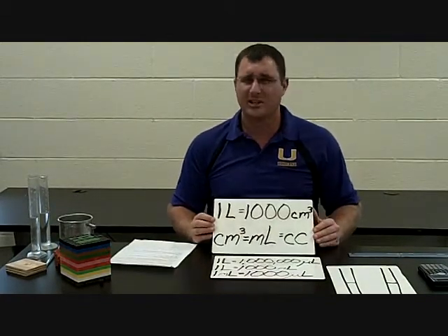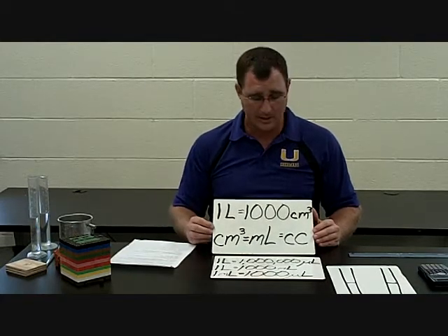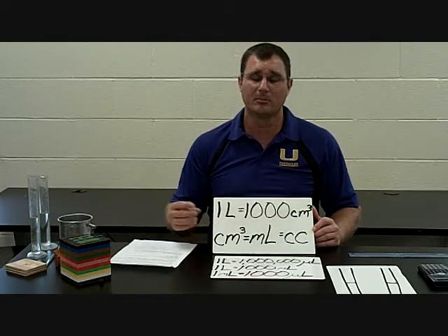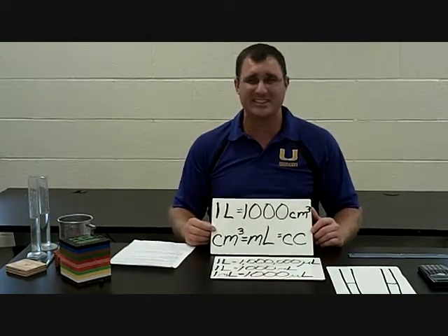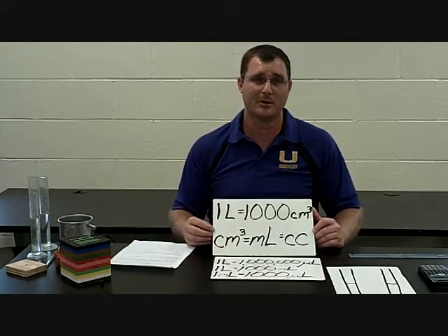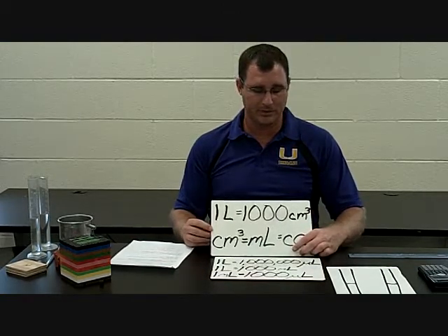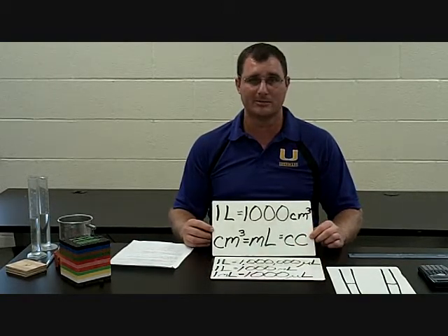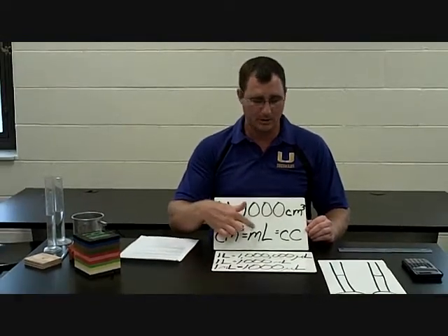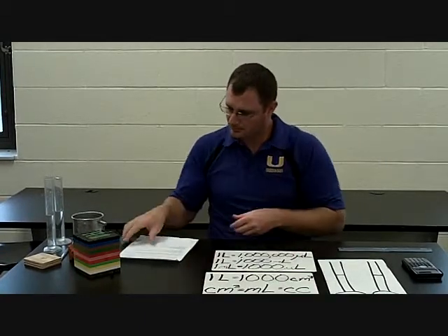And we'll use milliliters a lot in the chemistry lab. We'll refer to things as get 50 mLs, stuff like that. Now, if you work in the healthcare setting, a lot of times instead of calling them milliliters, they'll say cc's. So if you watch any medical shows, I know you've heard them say, give me 100 cc's of something stat. And cc's are simply referring to cubic centimeters. Okay, so these things are all interchangeable. Centimeter cubed, milliliters, or cc's. They're all the same thing.